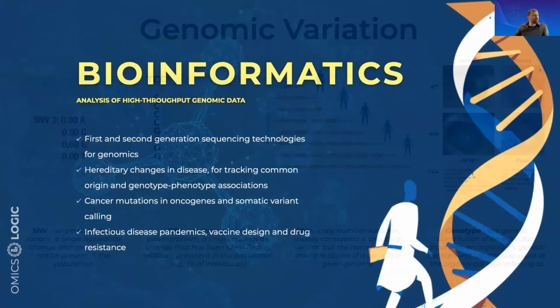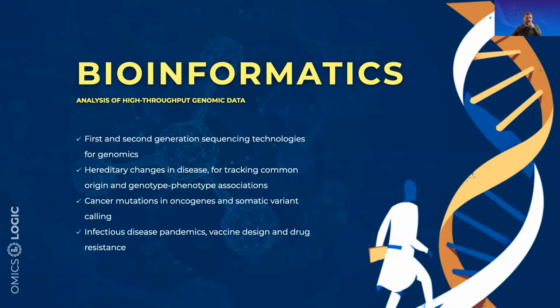So how does bioinformatics help us in this kind of genomic characterization of variants? Well, we will first need to understand how sequencing works to appreciate the need for computational analysis of genomic data, and then to actually practically see what this data looks like. So what I'll do in the next few slides is talk about sequencing technologies and how they differ from each other, and briefly jump into an example of one of these technologies.